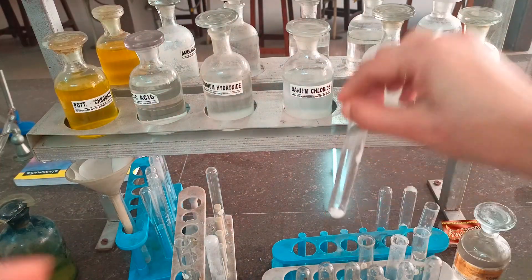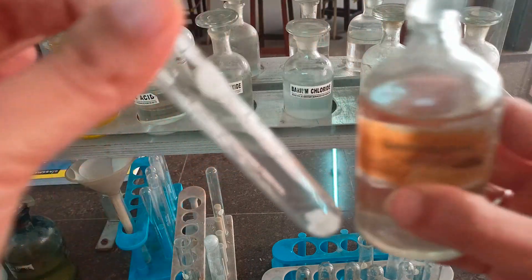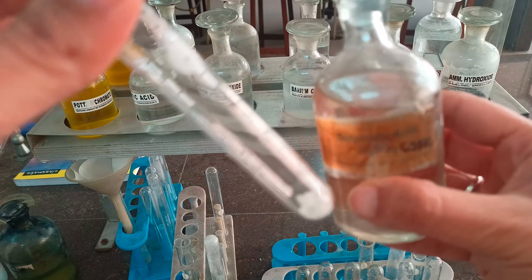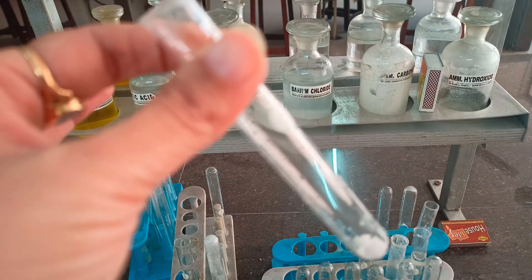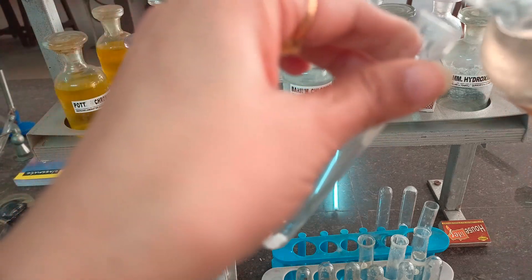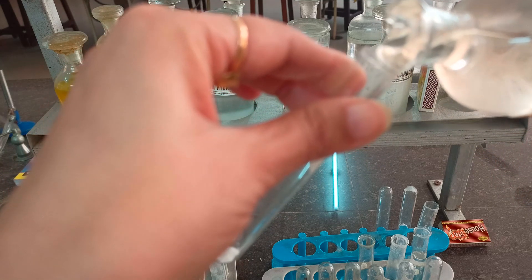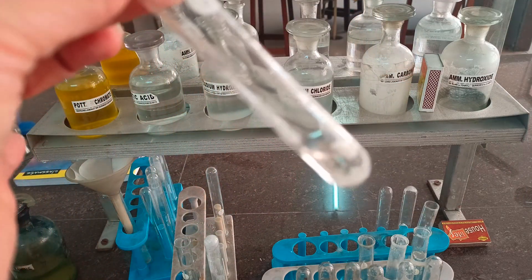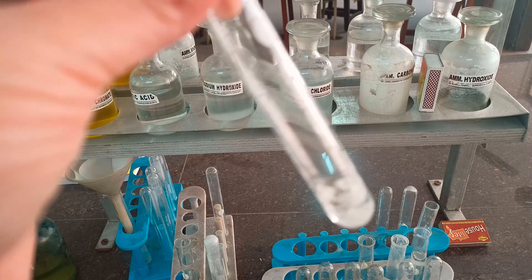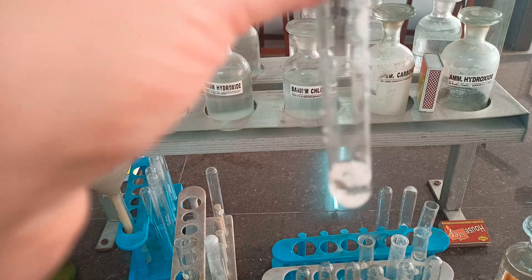Now taking another test tube with salt, I am adding concentrated sulfuric acid carefully. Again, no bubbles are coming up, no gas is evolved. This means chloride, bromide, iodide, nitrate, and acetate are all absent.